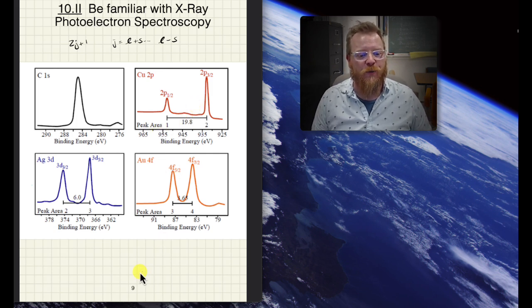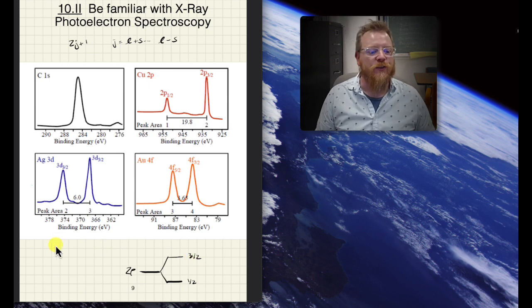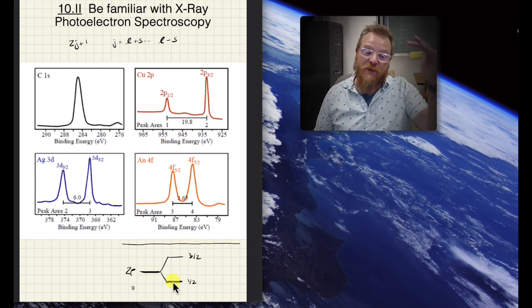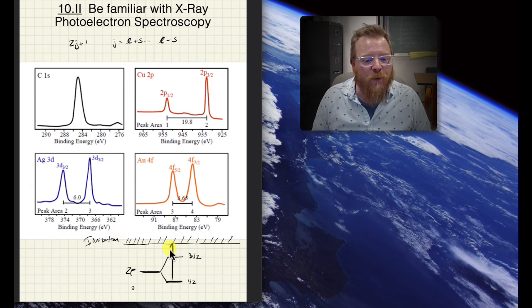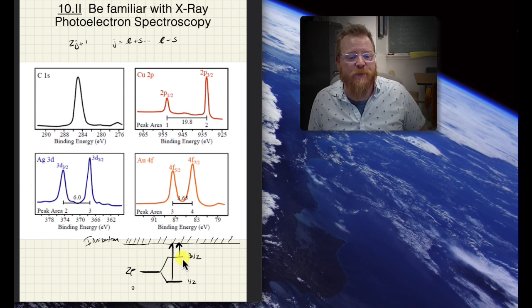Recall, for example, the 2p level, so there we're looking at copper 2p. That level will get split into the low J value, the J 1/2, where L is 1 and S is minus 1/2, and J is 3/2, that's our high J value. I noted earlier that the low J value has the higher binding energy, and that might seem counterintuitive because the low J value is lower in energy. That's because we have to remember this technique is relative to ionization, which is what I'm showing at the top of this scale. As you can see, it would take more energy to remove the J 1/2 value than the J 3/2 value. And the difference between those two levels is given by the spin-orbit splitting constant.